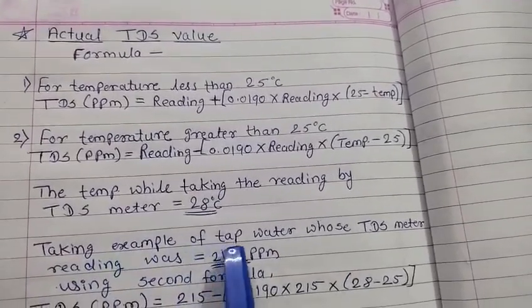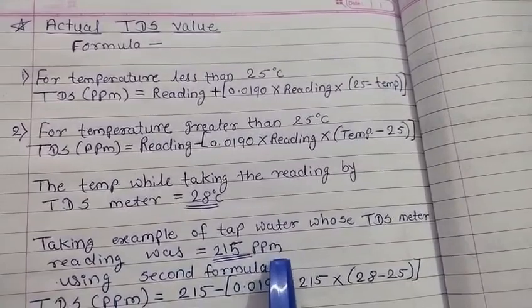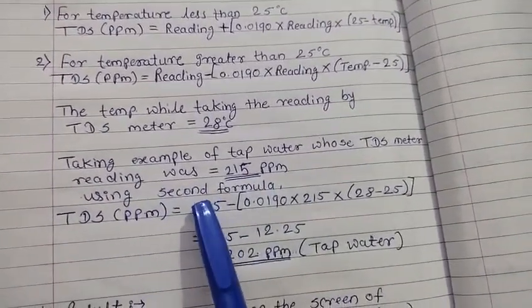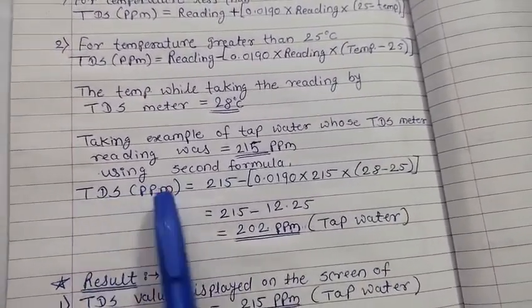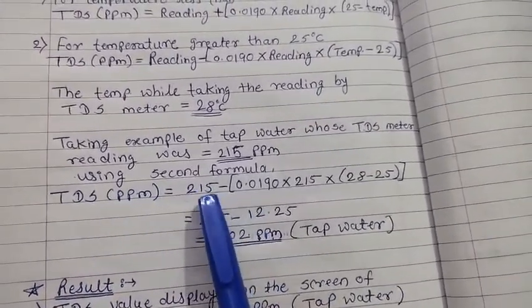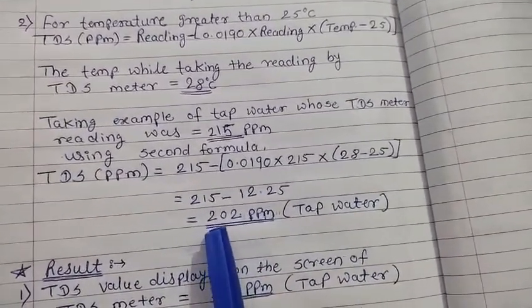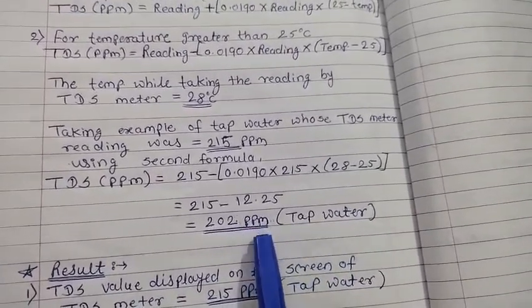We will take the example of tap water whose TDS meter reading was 215 parts per million, that is ppm. Using the second formula, the TDS, total dissolved solids in ppm, by putting all the values in the formula, we'll get the answer 202 ppm. Actual TDS value of tap water.